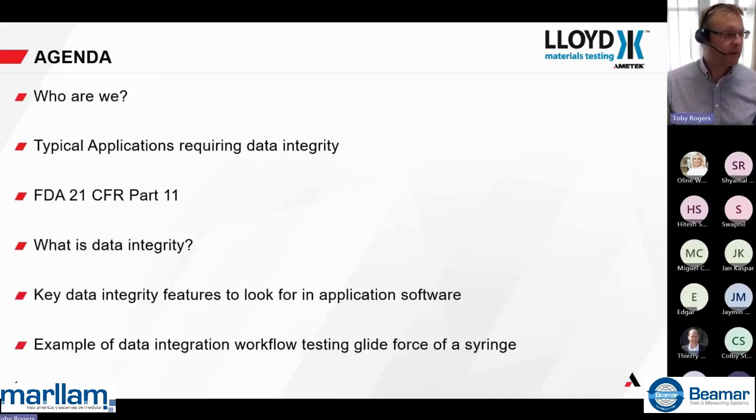So, a quick review of the agenda today. We'll have a quick look at who AMETEK STC are, and we'll look at some of the typical applications in materials testing that require data integrity. We'll then go into data integrity itself and how it relates to FDA 21 CFR Part 11, which is the key regulation governing the whole subject.